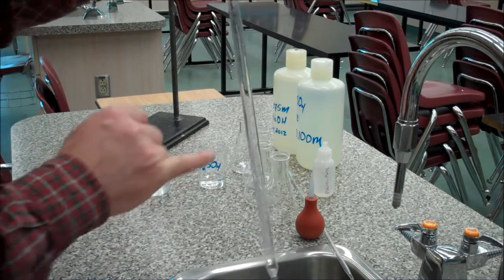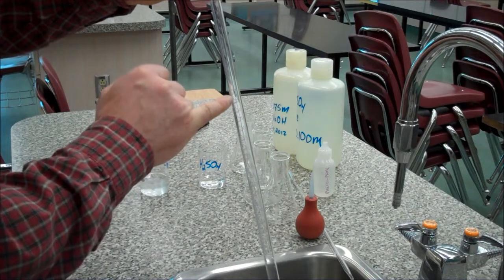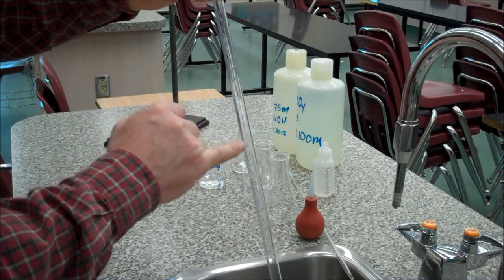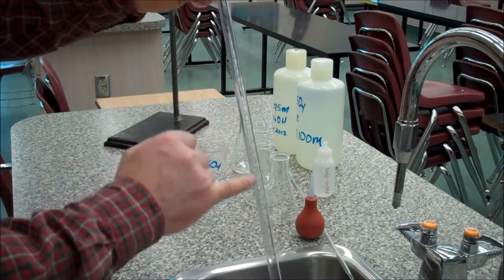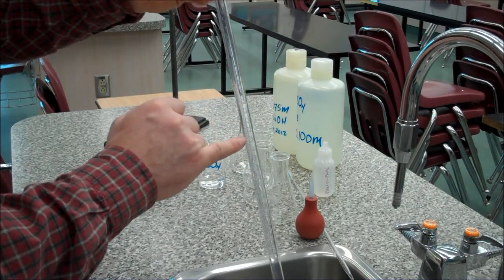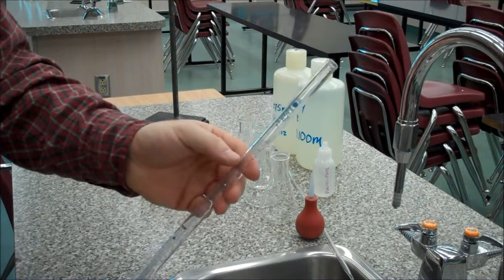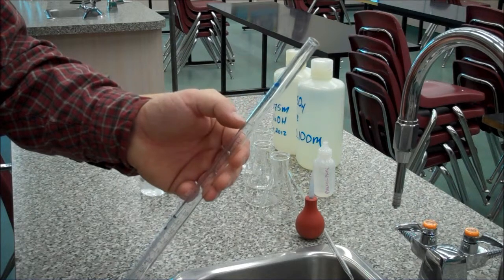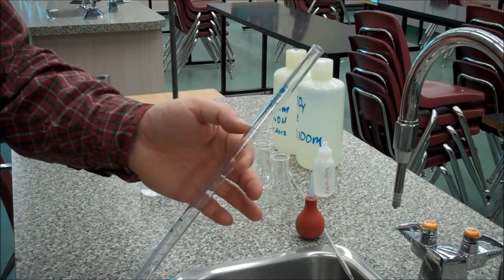You'll notice that the graduations on the burette are upside down, and so that it counts from the top downwards, and this is 32, 33, 34, 35, 36, 37, and it's counting downwards. So when you're using it, you have to be careful that you're reading it correctly. Okay, now we're going to fill it up beyond the top graduation, which is up here. So beyond the 0 a little bit, and then we'll let it drain down to the 0, so the bottom of the meniscus is on the 0, and that'll be our starting point.